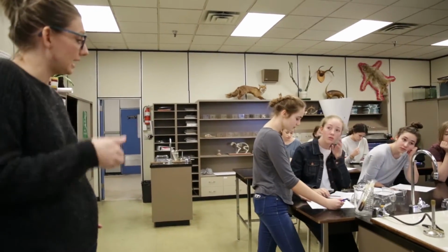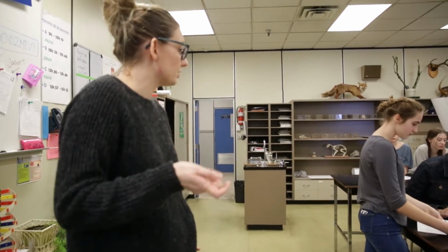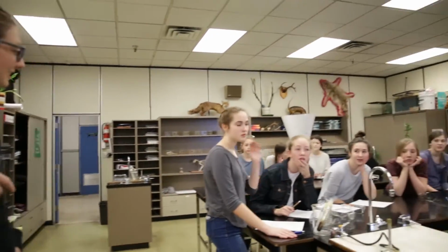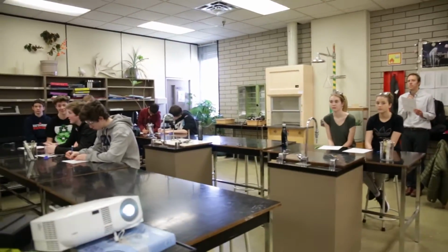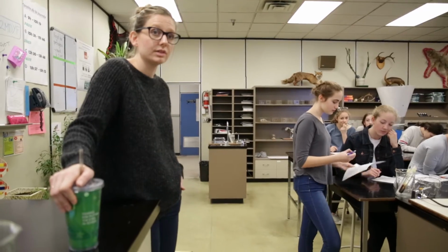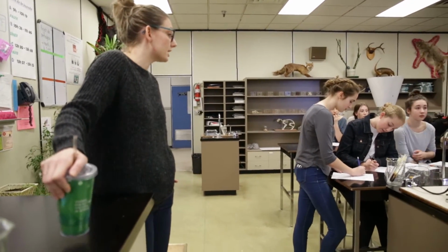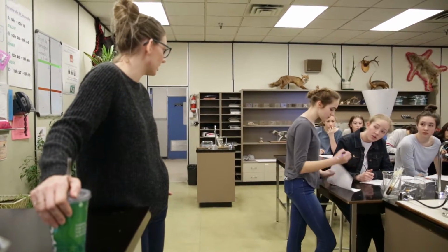We talked about A. We said that we would maybe be able to reverse this by adding water and redoing it. Do you think that you can do that with B? No. It's like burnt. It attached itself to the beaker. And it's all stuck to the test tube? So test tube A is a physical change. You're changing the state of something, you're just boiling the water off into a gas vapor, and the salt is left behind. Test tube B is a chemical change. You see a color change and you can't reverse it, right? There's no going back.